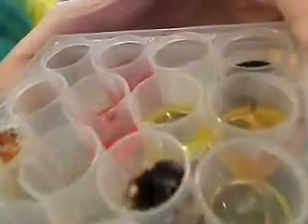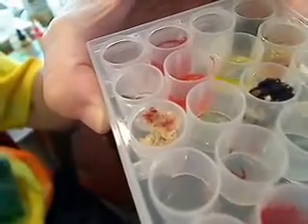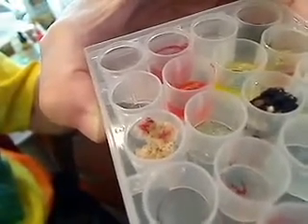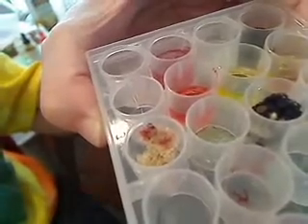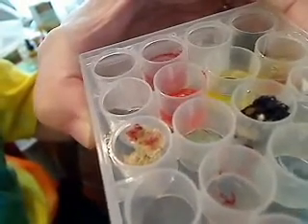So what happened with iodine as we go down the row? Nothing, nothing, nothing, nothing, nothing. Ooh! Who's black? Well, as it turns out, the black was the unknown solution. The only other reaction we got with iodine was with the bread. Trying to move this thing so you can see it. Okay, you're going to take my word for it. See that other black thing? That's a piece of bread in with some iodine. So of the 3 proteins, carbohydrates, and fats, what do you know bread to be? And so what would you say the reaction with iodine is for that one?